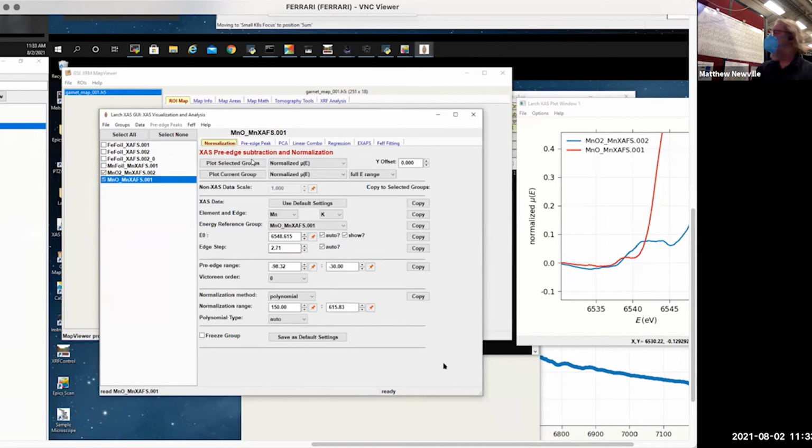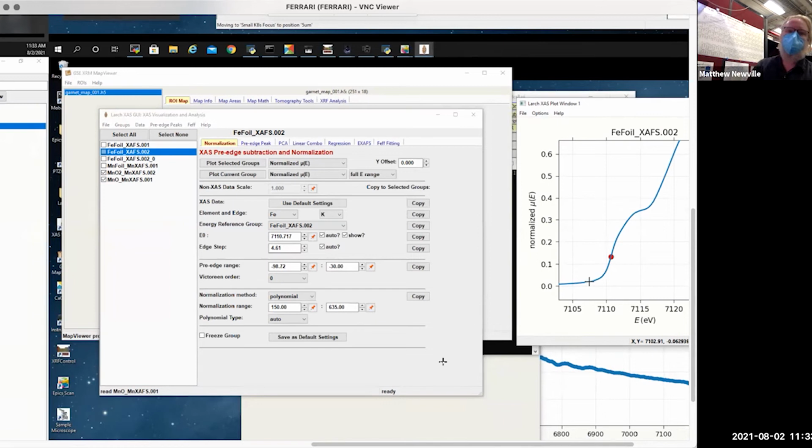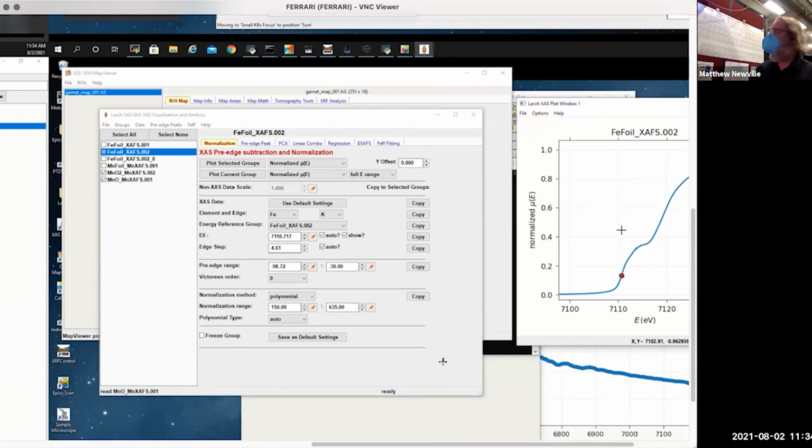So the iron foil, actually, if you look at that, there's not a pre-edge peak, that's the edge. And these energies at 7110 to 7115 are where the pre-edge peaks are in iron oxides. Because it's the same transition, that's where the Fermi level is for iron, at 7110 to 7111. And when you add the oxygen ligands, what happens is that the states above it empty out. Those are the antibonding states in the samples, an insulator, right? An oxide insulator. So what really happens is that you lose this step, or it pushes out to higher energy, and those are left as pre-edge peaks that are still at the atomic levels.